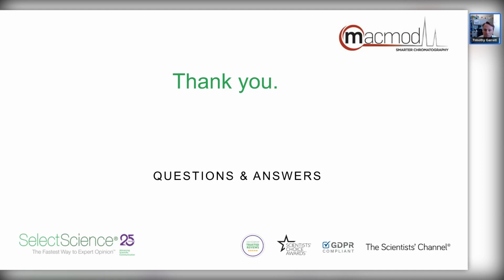Perfect, thank you. So following on from that study, what are the next steps for the study? The next step for that one is to expand, to try to get more samples, to create a larger study, especially getting samples related to those that have grade 3 diagnoses, because we didn't have many in grade 3. And so it'd be nice to get more so we could start to potentially differentiate grade 2 and grade 3.